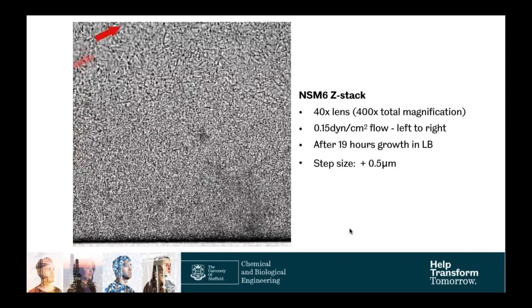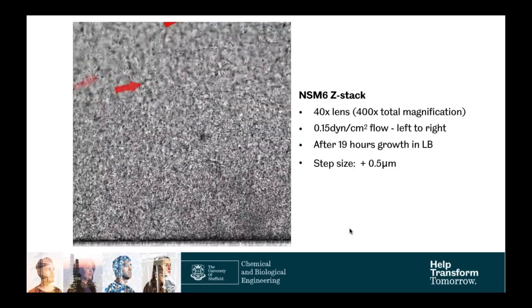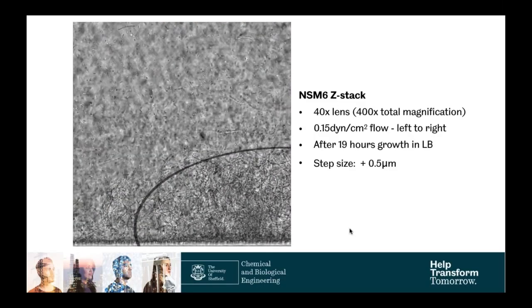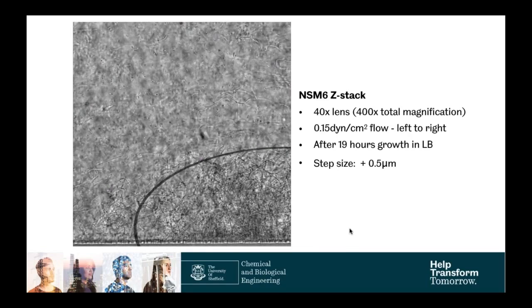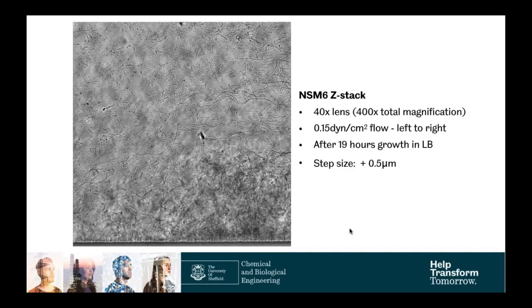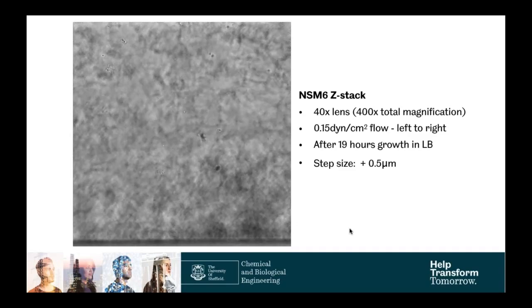And then as we increase the Z distance, you see flow appearing and this thicker structure appears in the bottom right that extends up into the channel and has a good bit of height to it before we hit the top of the channel there. And I really love this video. It shows the detail that you're able to achieve with the integrated system that we have. And it was quite easy to set up as well. So that's everything that I wanted to show.